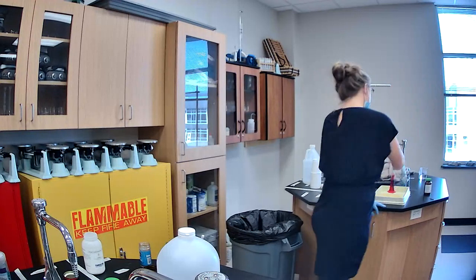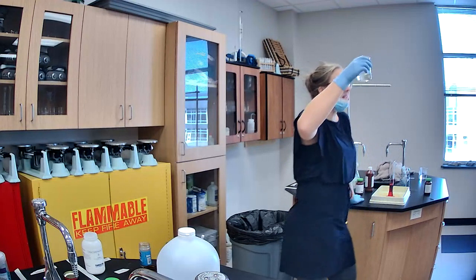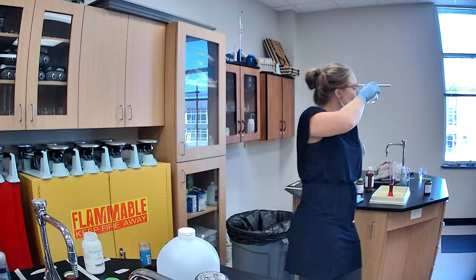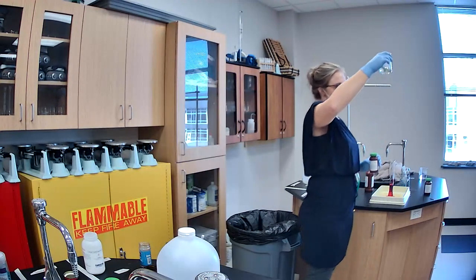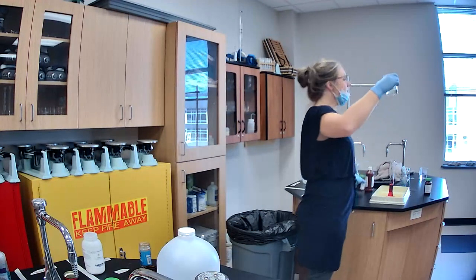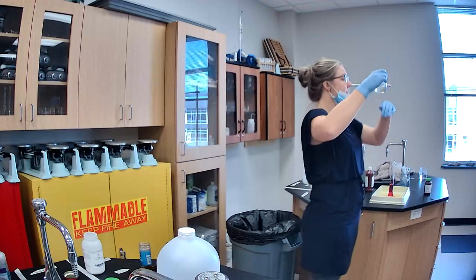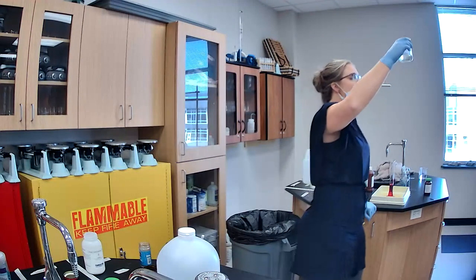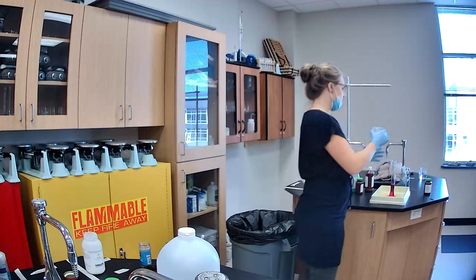Now, we're going to add our catalyst. A catalyst is what causes the reaction to happen. Earlier this morning, I came in and tried to saturate this water with potassium iodide. Do you remember the experiment we did on the computer where we had to keep adding stuff and trying to dissolve it until it just couldn't do it anymore? That's what we tried to do here. So I have a lot of potassium iodide in here. I'm going to pour it into the cylinder, and let's see if we can get a reaction out of it.